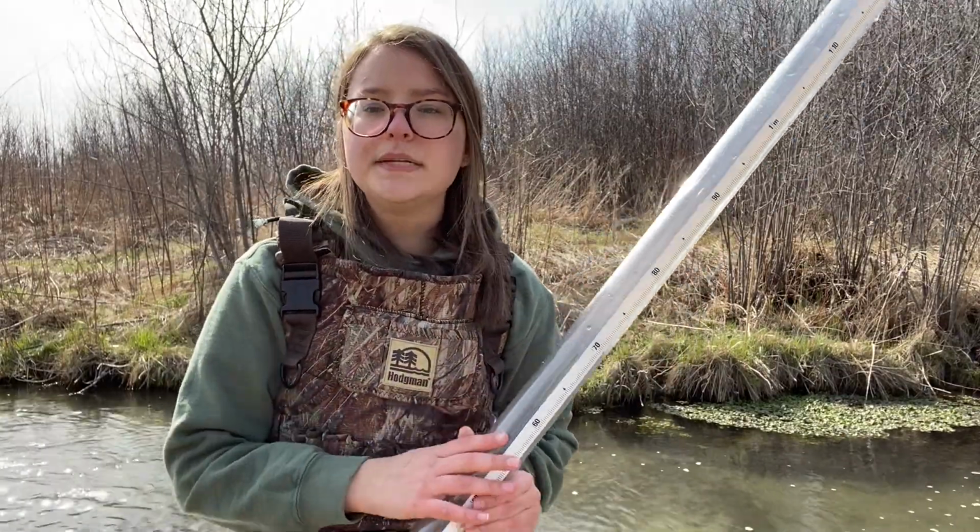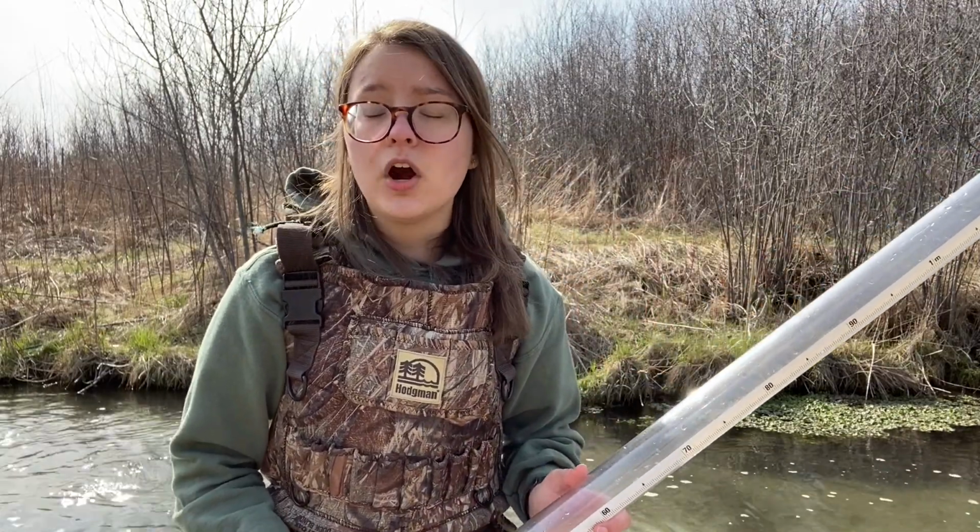Now, if I come out one day to monitor and I notice the clarity is something crazy like 30 centimeters, very low, that means it's very cloudy and there's a lot of sediment kicked up in the stream, I know there's something up. So I'll take this information, input it into the SWIMS database like I normally would, and then I may contact my local coordinator to let them know what's going on. The Wisconsin DNR may take this information, come out and take a further look. Now, for the clarity, we take 2 measurements. We do the same test twice, and then we take the average of the 2 results to find our official clarity of the stream.